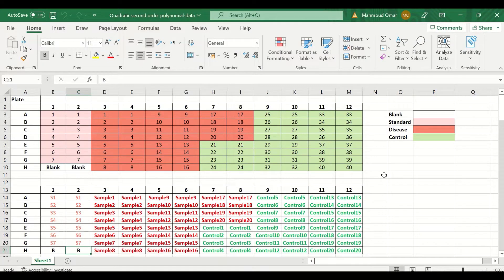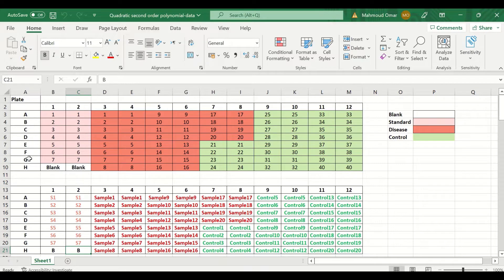Here in this Excel sheet, I had inserted a layout and design for the 96-well plate that has been used in the ELISA assay. The plate was sectioned into parts. In the first two columns, the standard samples were loaded in duplicate from A to G, columns 1 and 2. For row H, positions 1 and 2, a blank was inserted.